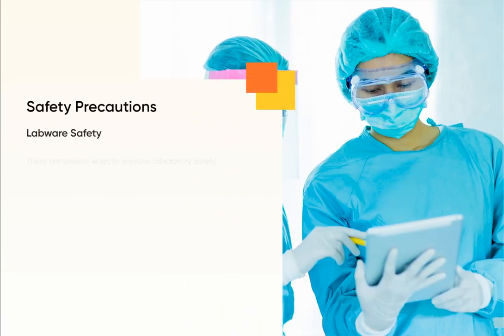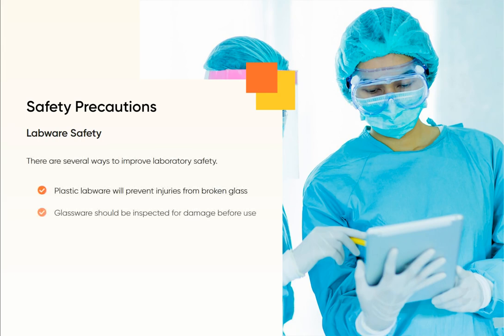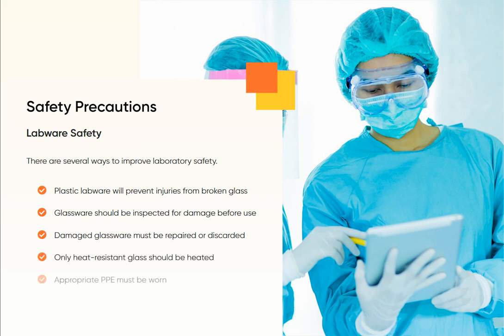There are several ways to improve laboratory safety. Plastic labware will prevent injuries from broken glass. Glassware should be inspected for damage before use, and damaged glassware must be repaired or discarded. Only heat-resistant glass should be heated, and appropriate PPE must be worn.